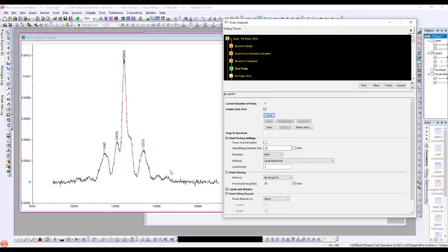Okay, so like this hidden peak is not found. And even after I do smoothing, this hidden peak also cannot be found. We may want to lower the threshold in order to detect these small peaks. Give it a small value, 3. Okay, 3 is good.